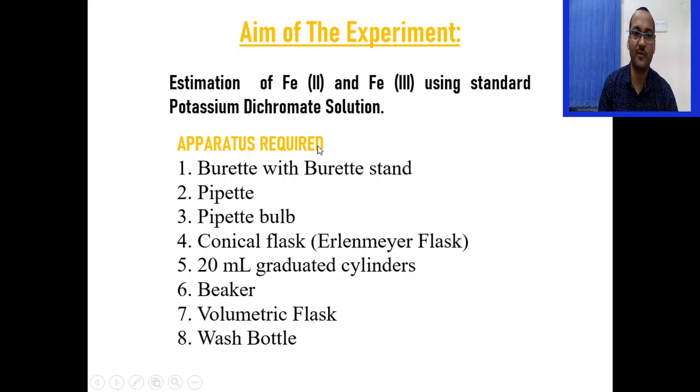The apparatus required for this experiment are: burette with burette stand, pipette, pipette bulb, conical flask, graduated cylinder, beaker, volumetric flask, and wash bottle.